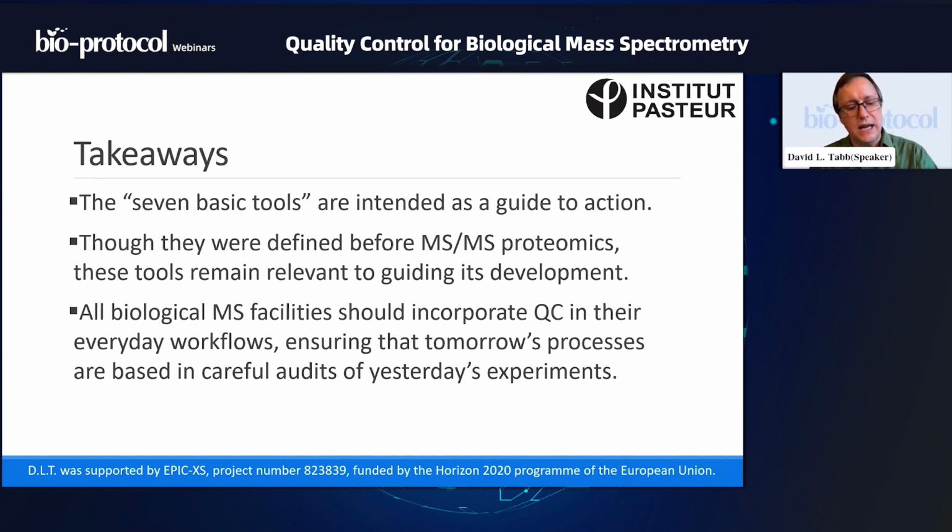So when we see a check sheet value that falls outside the realm that it's supposed to be, when we see that one cause is leading to almost all of the failures of our instrument, if we don't use that to guide our actions, we're losing the value that experiment could actually pose for us. So when you make use of these 7 basic tools, you are in fact telling yourself what to do in response to see that your instrument continues in good health.